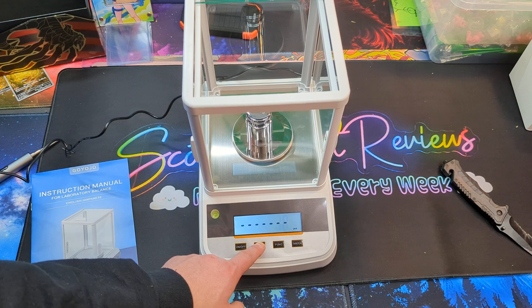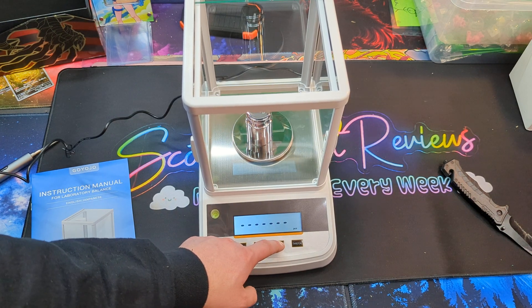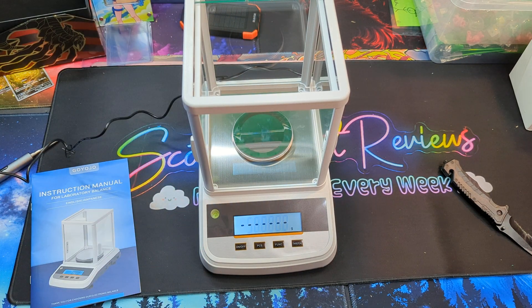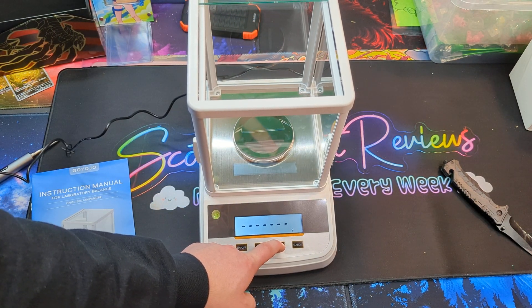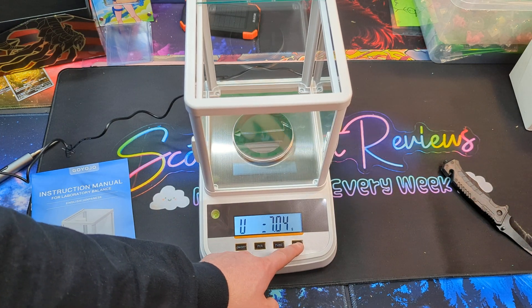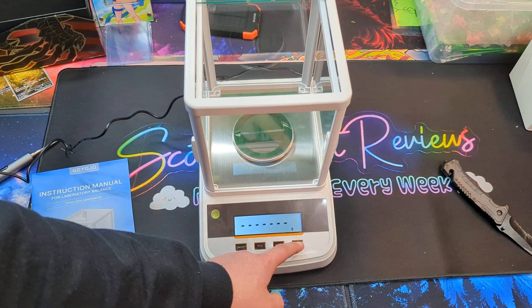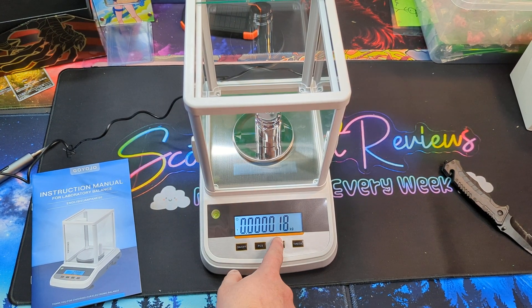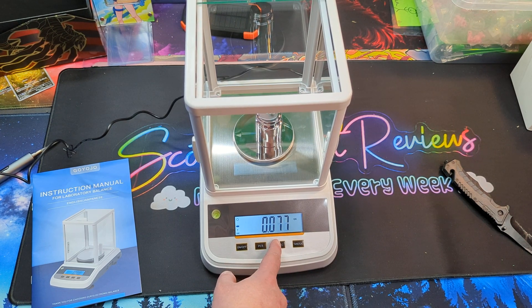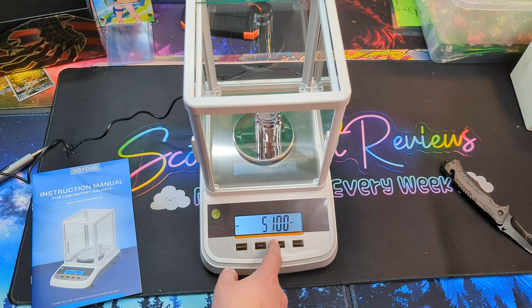You can change the different settings. Let's go ahead and reset this — make sure nothing's on the scale when you set it up. Once something's on, you can change the units: kg, ct, t, tar, dr, pk, t, gn, tmr, gsm, t, lj.